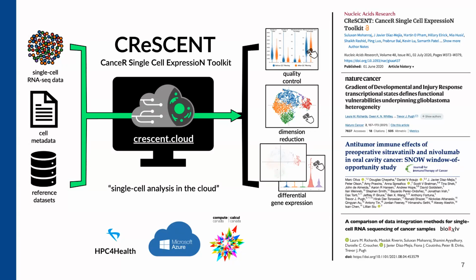So if you have very specific cell cultures or labels for these cells, then you can bring those in as well. And Crescent provides a whole bunch of reference data sets. So this effort is ongoing, but currently there's about 300,000 cells covering 20 projects of published data. And the entirety of Crescent is currently holding over 150 million cells across all kinds of private and public projects. And I'll talk about that later, about that discrepancy between private and public.